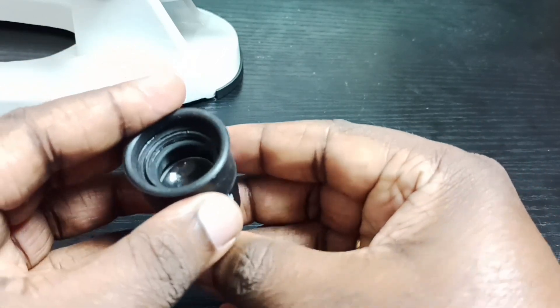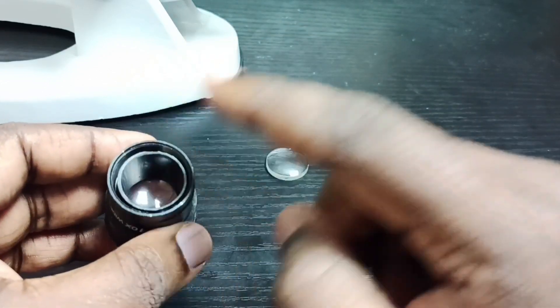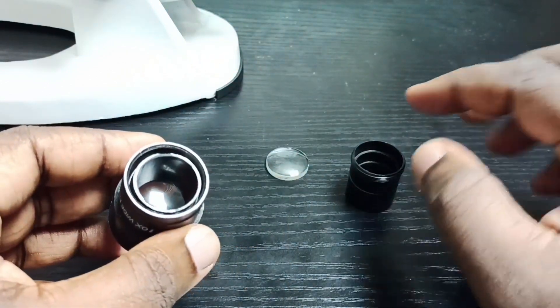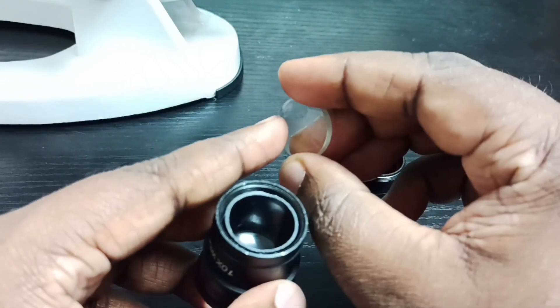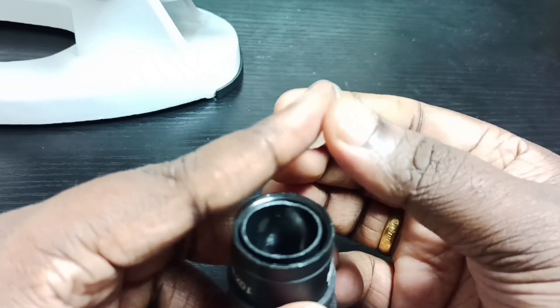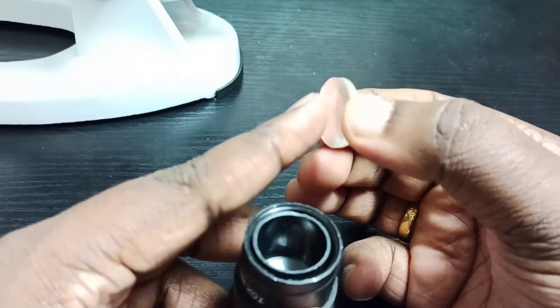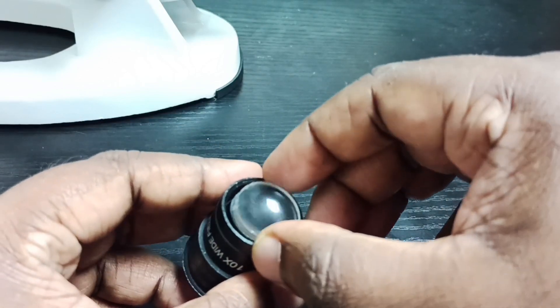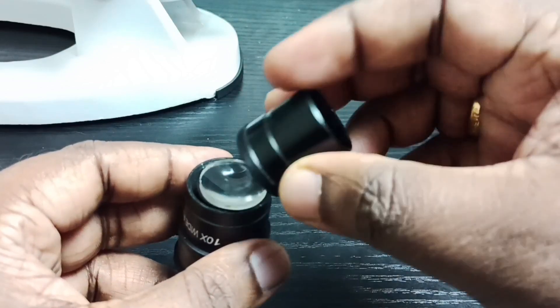The side which is straight you can place inside. Then for the second lens — one side has a bulge and the other side is straight. The side which has a bulge goes inside, and then the straight side faces out so you can close it.